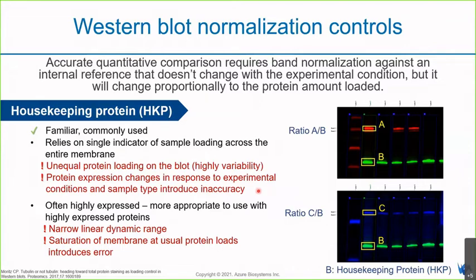And besides, in some cases, housekeeping proteins do not show consistent expression between the samples. There is a lot of evidence out there, especially in scientific publications, showing that the experimental conditions, and even the sample types and the time at which you take the samples, will change the expression of these very commonly used housekeeping proteins.